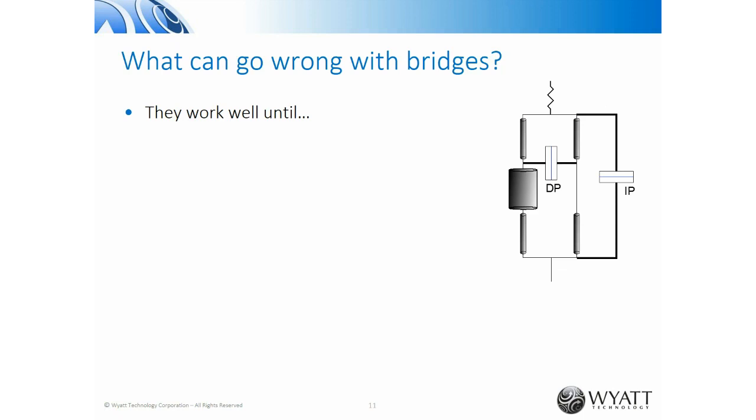Okay, well now we have an instrument that's incredibly sensitive and very immune to the pump pulses. Not completely immune, but it has tremendous suppression of the pump pulses. And these bridges work beautifully, but one of the key points of bridges is that you have to get all 4 of these capillaries very well matched. And however well you match them, as you use the instrument over time, and let's say you played a little bit of sample on the inside of the capillaries, then this bridge will slowly get out of balance.